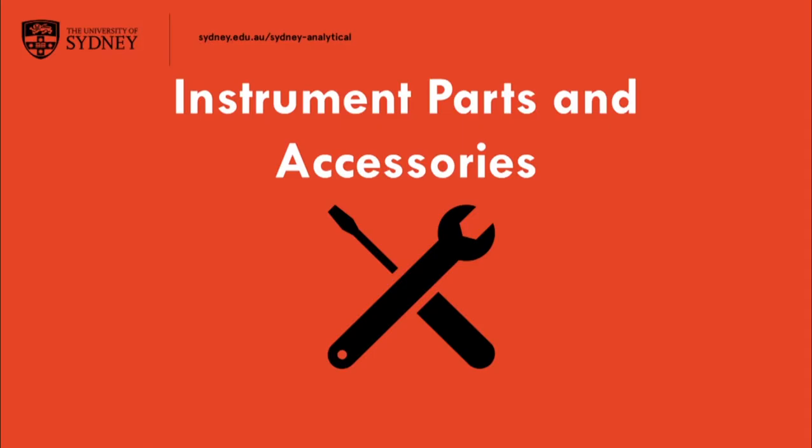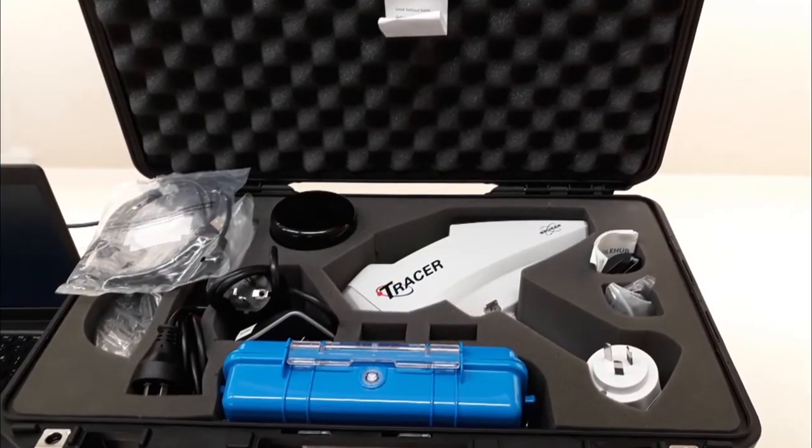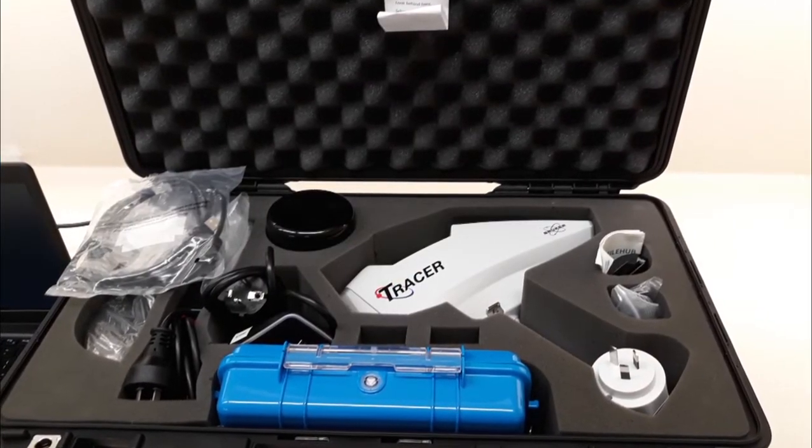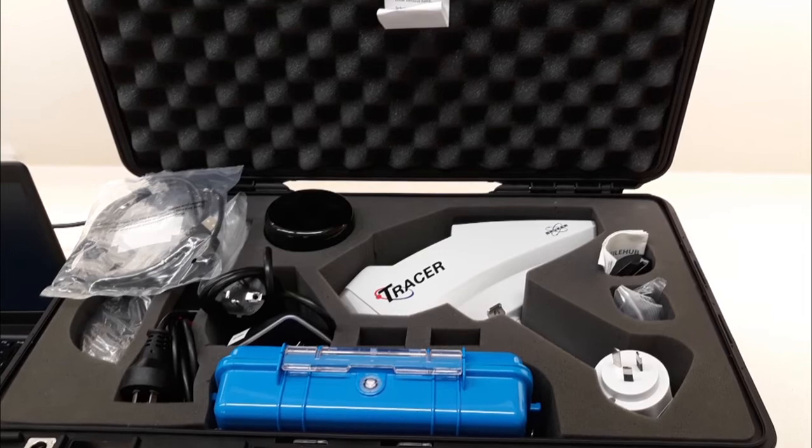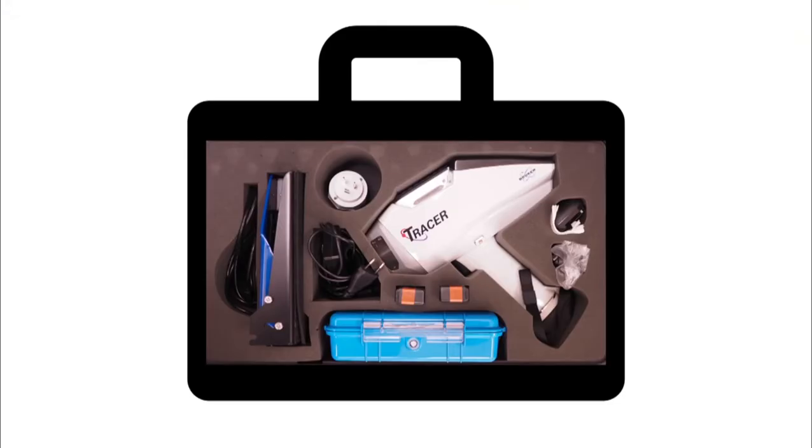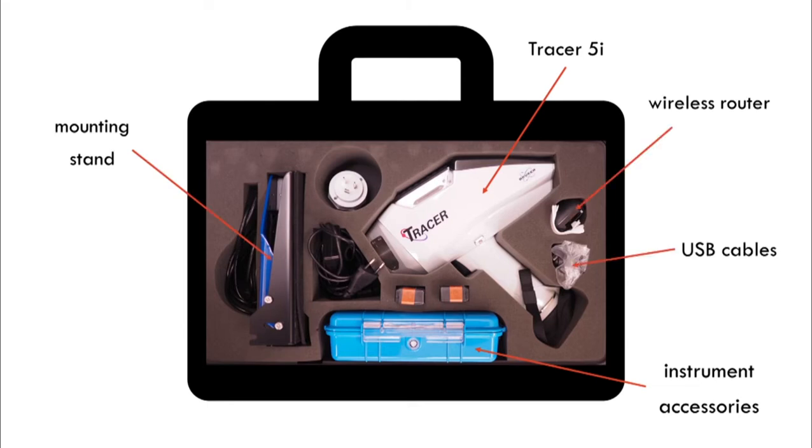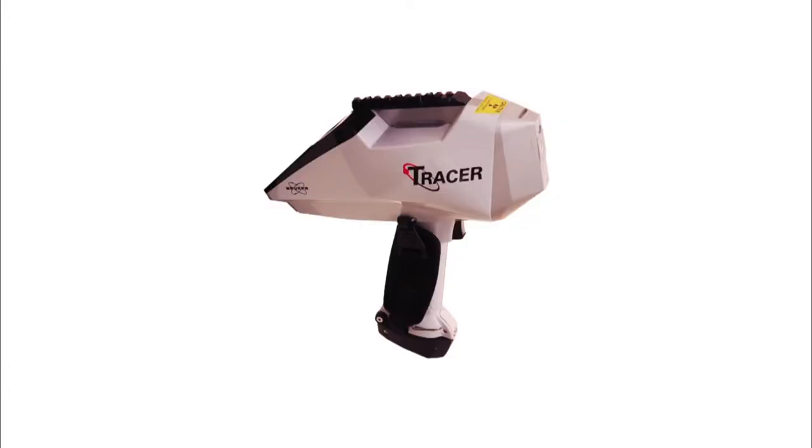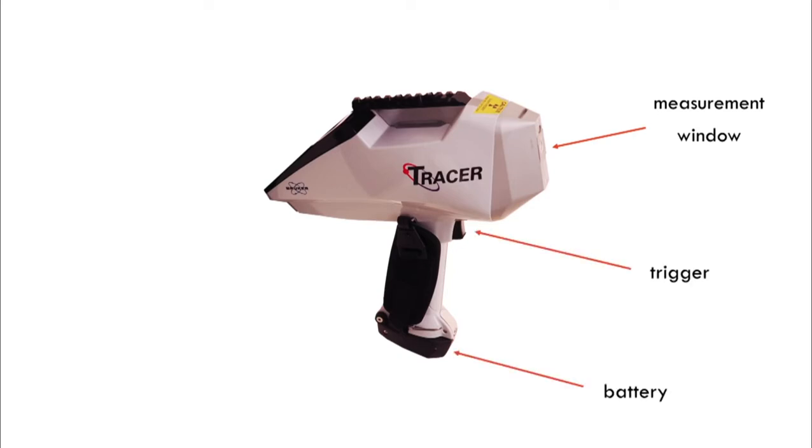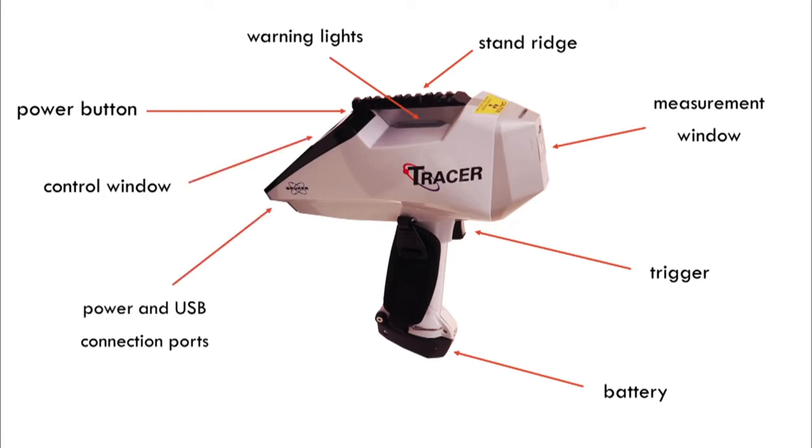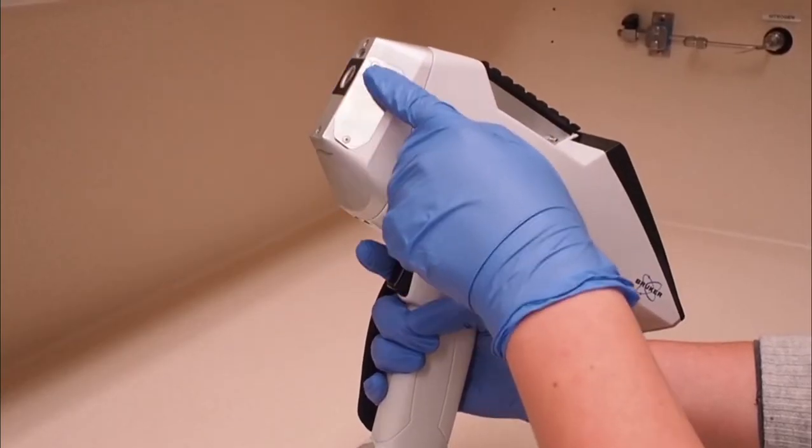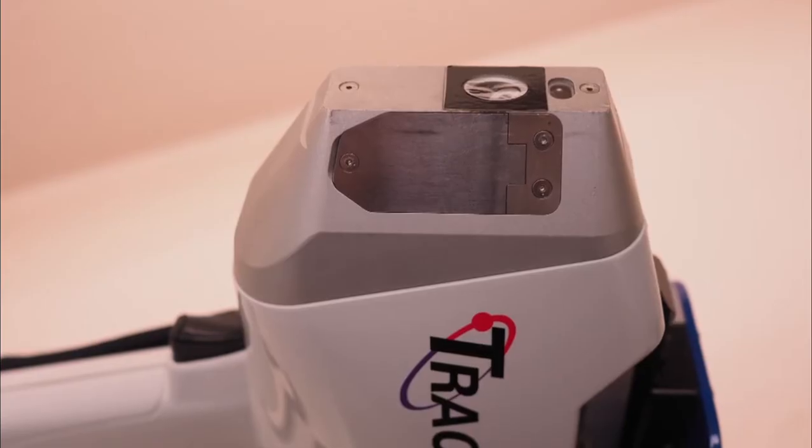Instrument parts and accessories. The tracer packs into a hard case for transportation and is stored in this case when not in use. In the hard case, you will also find instrument accessories, a mounting stand, USB cables, wireless router and battery charger. On the instrument itself, you will find a measurement window from which the x-rays are emitted, trigger, battery compartment, stand ridge and warning lights, power button, control window and power and USB connection ports. It is extremely important that you never touch the measurement window.